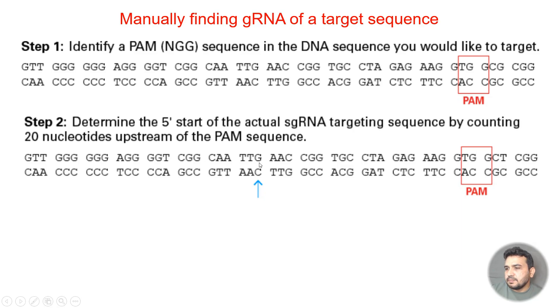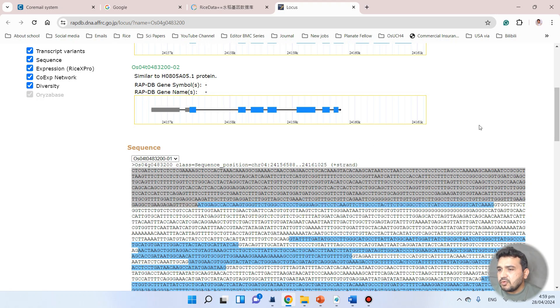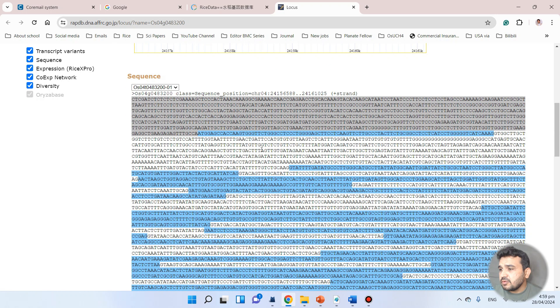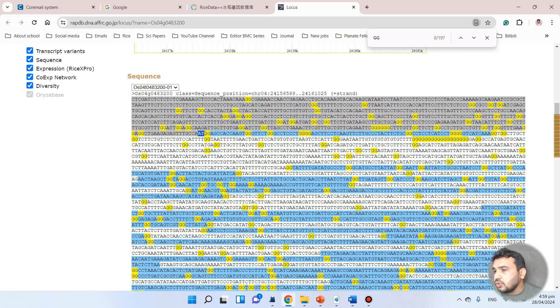Counting 18, 19, and 20 nucleotides upstream — AAG and G would be our guide RNA sequence. If you want to find the PAM sequence in the first exon, you can simply use Ctrl+F and write double G. Here we have double G, but we cannot take this one because on the upstream there are only two nucleotides.